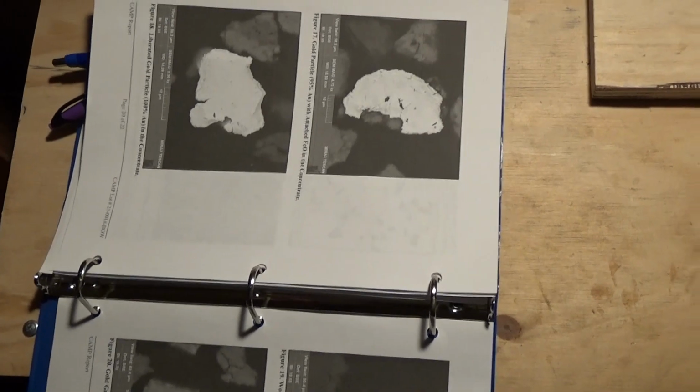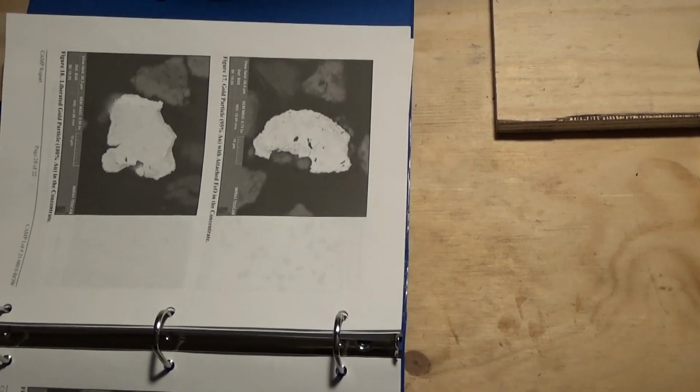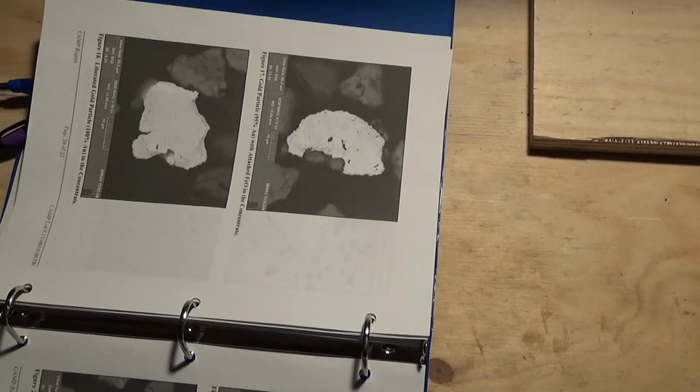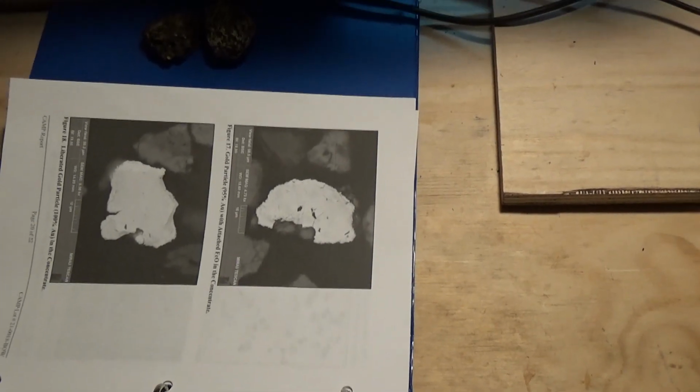So I will be doing a wet magnetic separation myself later. We'll show you that anyhow. And then the wet gravity separation on the Mosley table, it looked like it did a pretty good job of getting us a gravity concentrate. We've got the heads, tails, cons, to be sent off for assay here shortly, and then we'll actually have some results. So let me get to the actual stuff so you can see what they did.